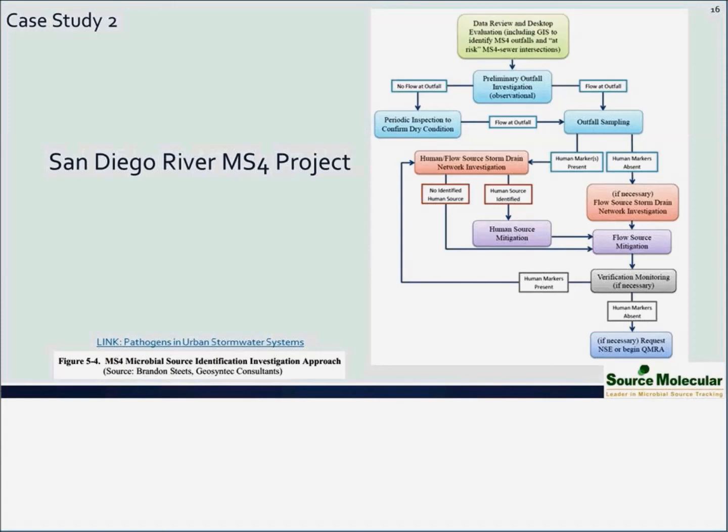They have recommendations of tests for the specific sources that might be causing pollution at your sites. But we do help. I mean, we sometimes work through an engineering firm that provides insight on structuring a project, but we do provide assistance also on whatever knowledge we've gained over the last 12 years, and we do try to help people in more of a supporting role on how to set up these projects and which tests to use. And there is advice in the guide document.